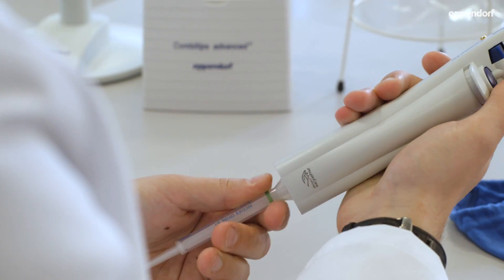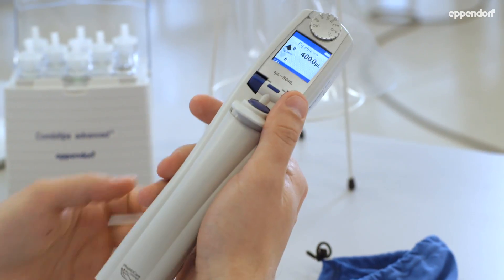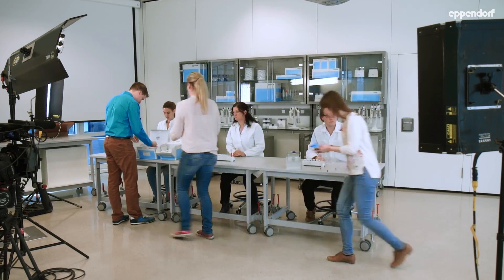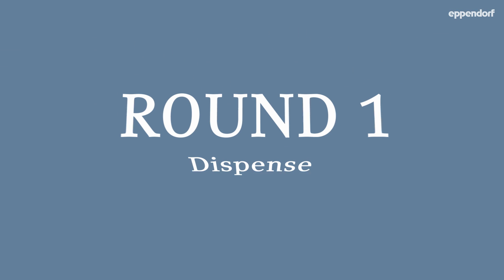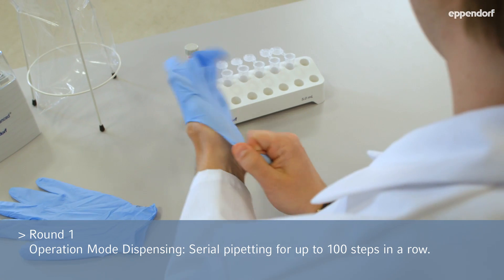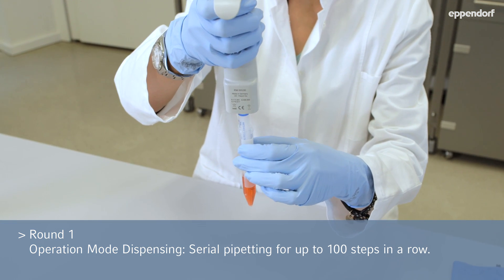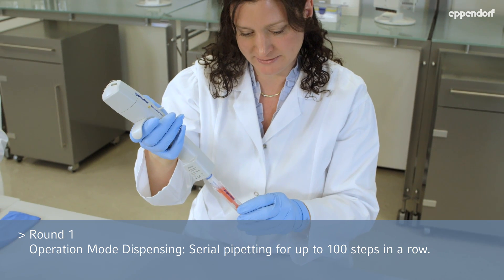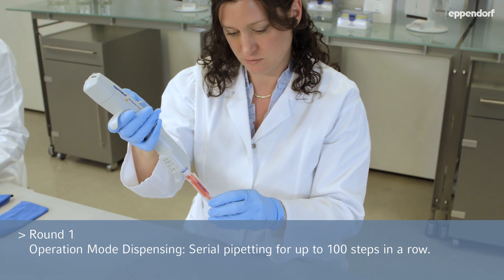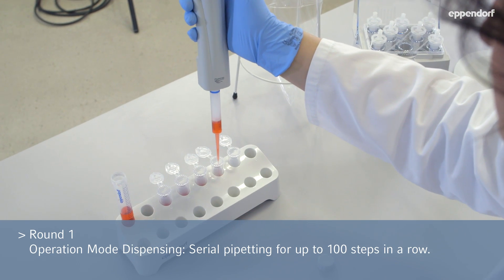Attach the tip. That was easy, and it even recognizes it. The tip fits in the tube, which is great. You don't have to hold it pressed down — pressing once is sufficient. It also has a countdown function. That works very well.